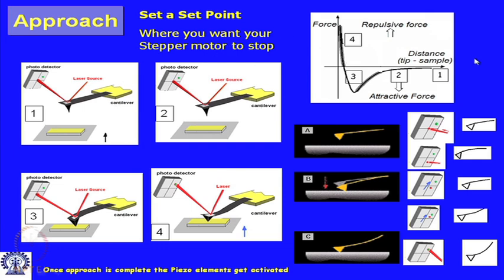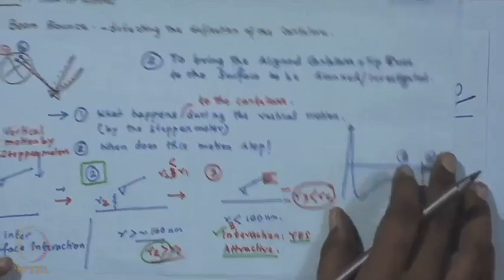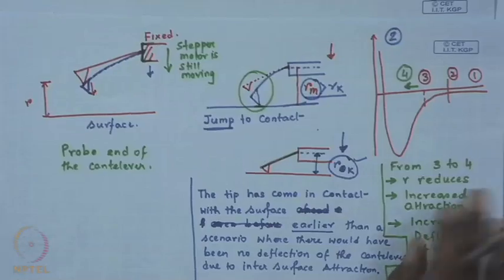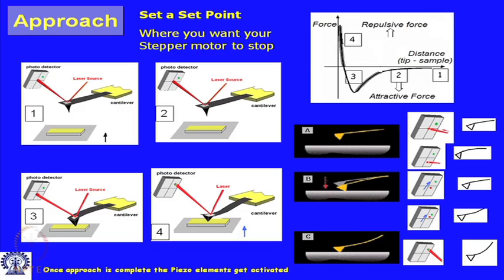So, you are still somewhere over here in the force curve, still no interaction. Then in figure 3, you now see that the cantilever has deflected due to the positive attraction. We have talked about it; it corresponds to this configuration. But what you now see additionally on this cartoon is something we deliberately did not talk about. I did not want you to get confused, so I avoided talking about it.